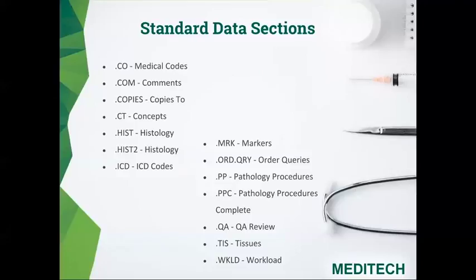The next data section is the .icd, which stands for the ICD code. You will use this data section to add or delete ICD codes associated with a specimen. The next data section that we have is the .mrk, which is for markers. You will use this data section to add or delete markers associated with the specimen. The markers data section also appears if you edit the medical code data section by adding a marker to a medical term.